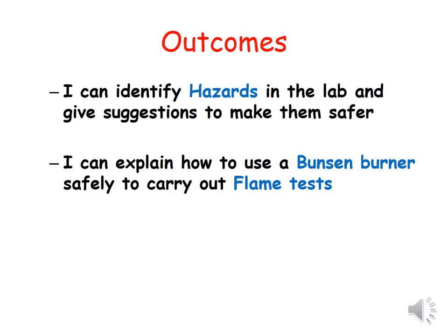So during today's session we will be looking at two different things. The first one is looking at hazards within a science lab and ways in which we can prevent these hazards from happening. The second part will be looking at how to use a Bunsen burner and how we would safely carry out a flame test.